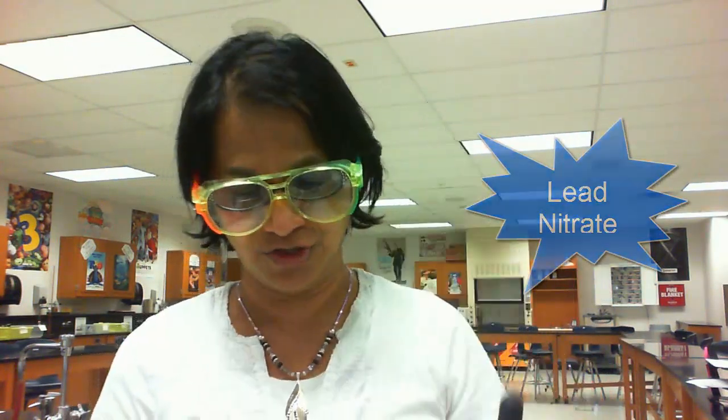Let me begin with our first reaction. We are actually going to mix two clear colorless liquids. What I have here is a dilute lead nitrate solution, and what I have over here is potassium iodide solution. So you might imagine we are going to mix two colorless solutions. What might happen? We might just end up having a big large colorless solution.